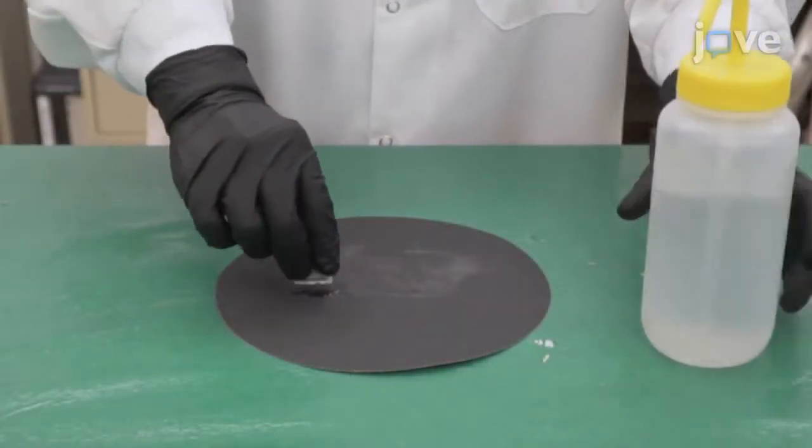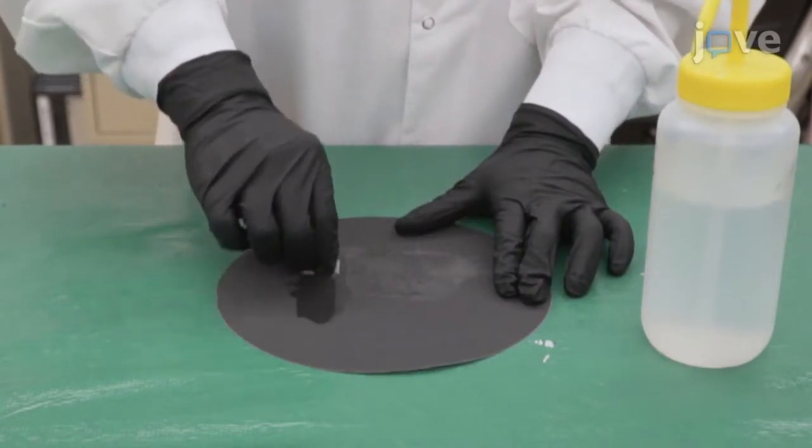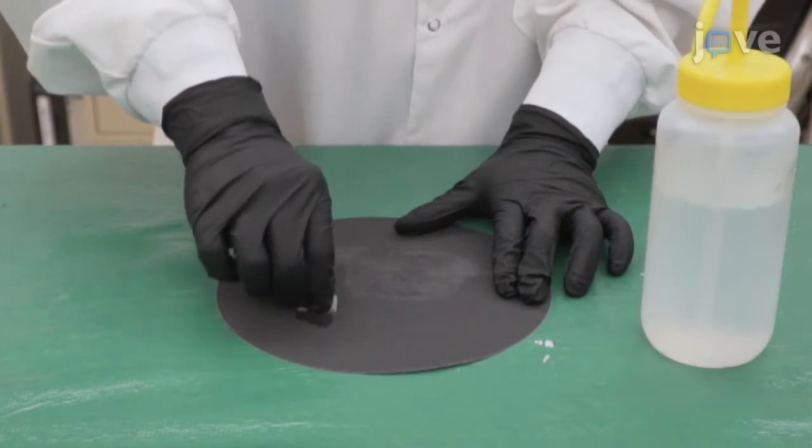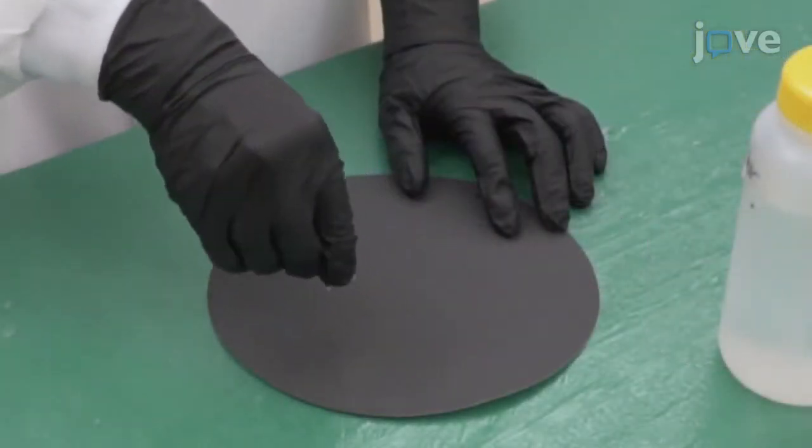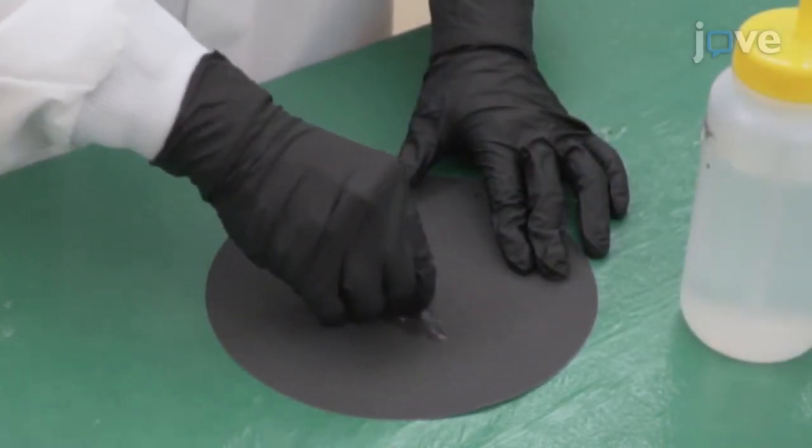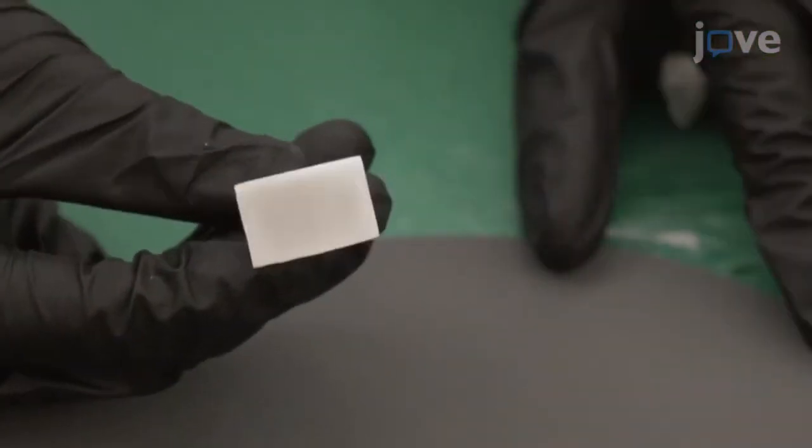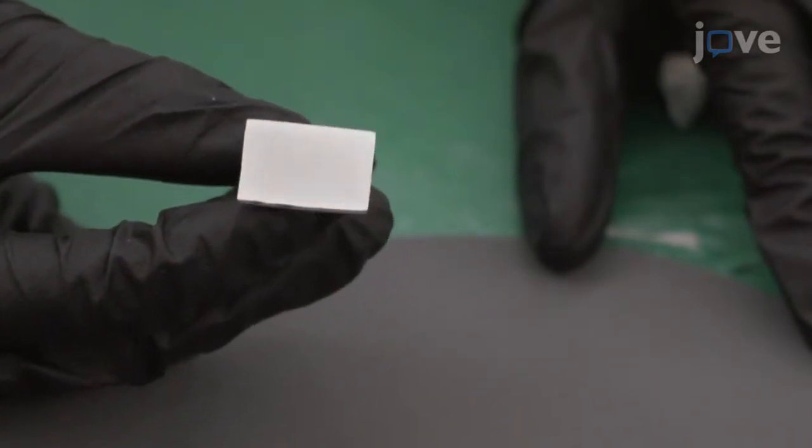Using 180 grit sandpaper, mechanically grind one side of each sample for 30 seconds along one arbitrary direction. Rotate the sample 90 degrees and grind the alloy with 240 grit sandpaper until the scratch lines from the previous step are completely removed, as confirmed by optical microscopy.